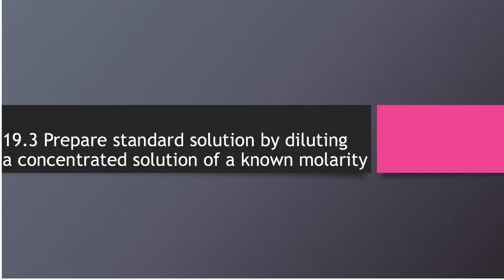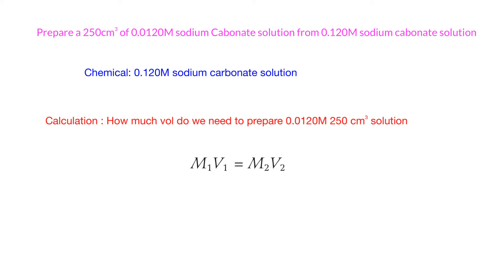We're going to talk about preparing a standard solution by diluting a concentrated solution of known molarity. This time we're going to prepare 250 cm³ of 0.012M sodium carbonate solution from a more concentrated sodium carbonate solution. You can see that this one is 0.12, and this one is 0.012.